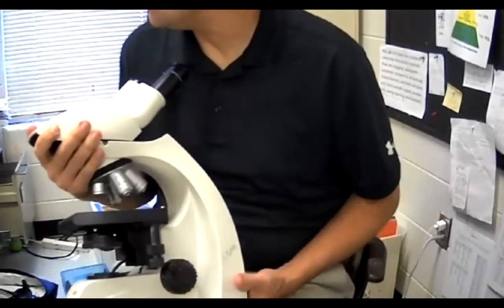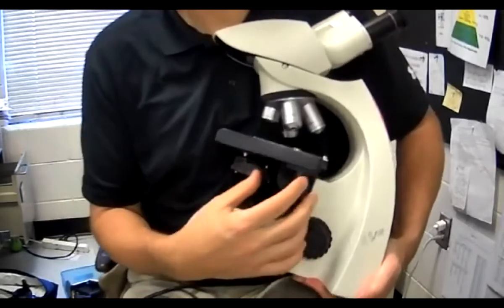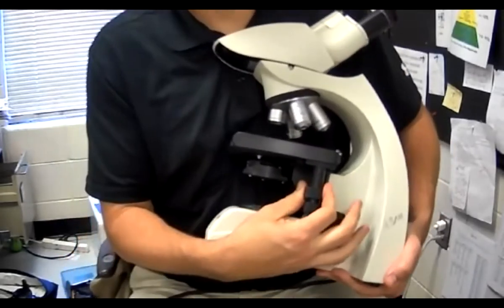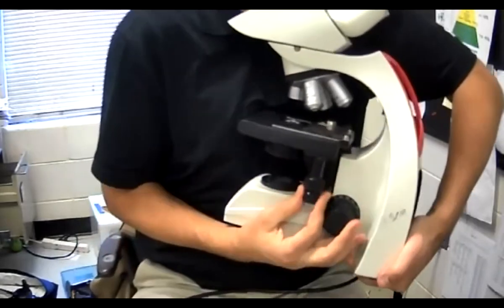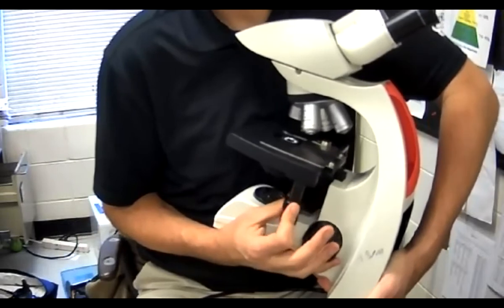They don't always tell you this, but these are the stage knobs. These are the stage knobs — they control the stage.